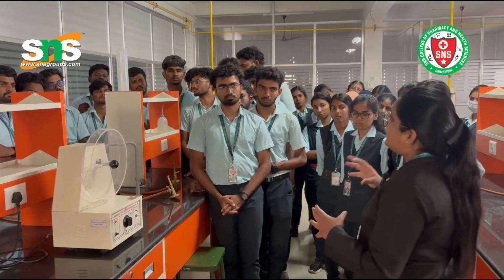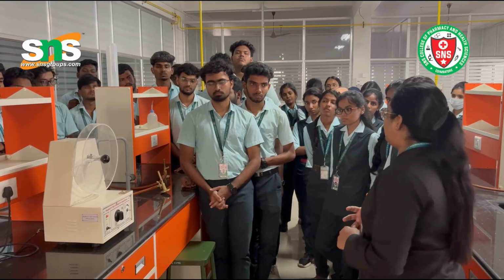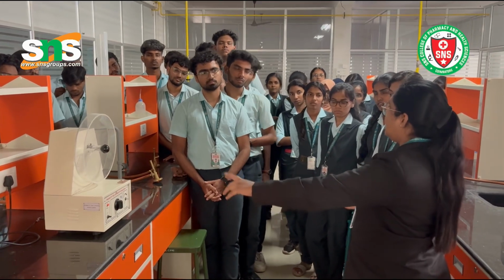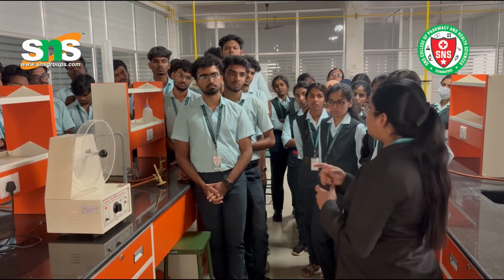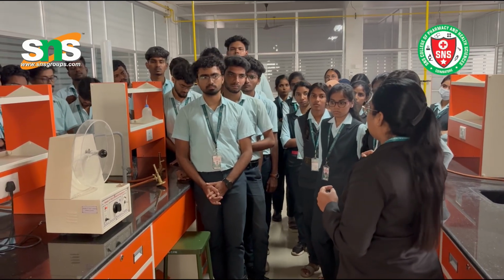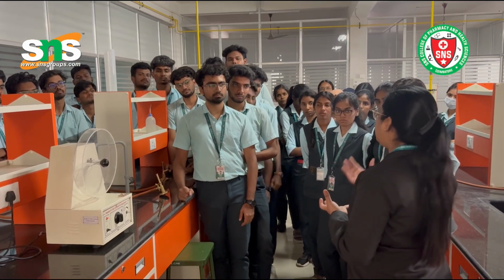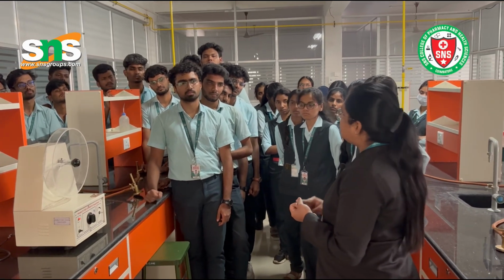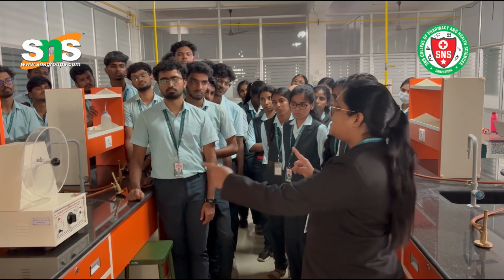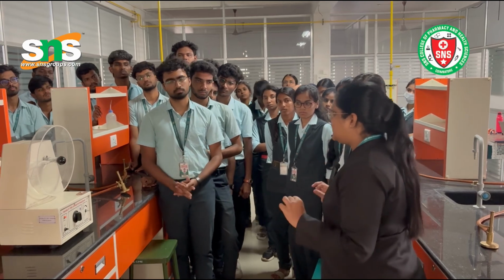I think you know about this friability test apparatus. Before entering into the design thinking scenario, I'll explain what this friability test apparatus is. Some of the tablets which you have already prepared, you'll keep in this, and we'll do the friability test, which is an evaluation test of the tablets. That means you have already prepared tablets, and whether they are in standards or not, we have many tests: weight variation, disintegration, dissolution, hardness. Along with that, this is one of the tests. We perform this friability test with the friability test apparatus.